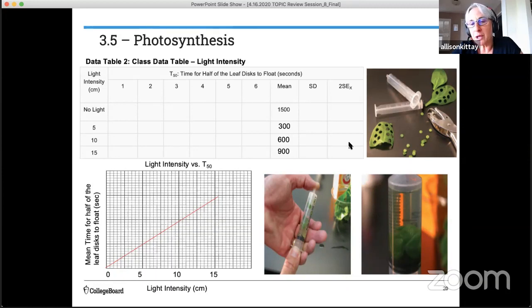And you are going to get rid of all those gases inside the leaf disc by putting your thumb over the top of the syringe and pulling on the plunger. And what happens, you'll feel that pressure and all that. You'll see air bubbles, and all those air bubbles you want to get rid of. So you do that by pushing the fluid all the way to the top. And if you do this properly, all of your leaf discs will sink.